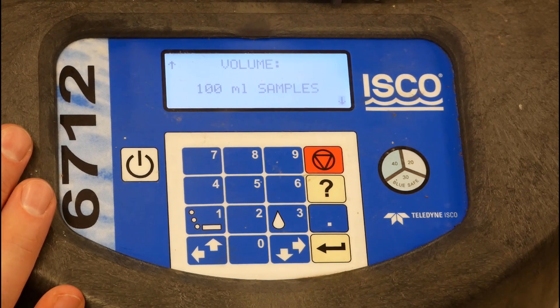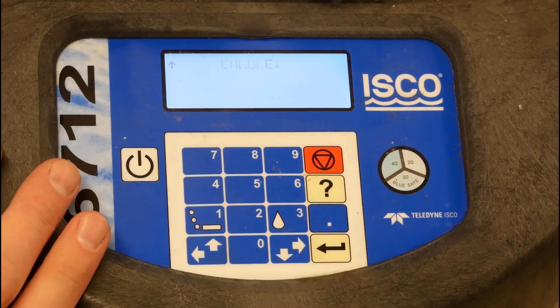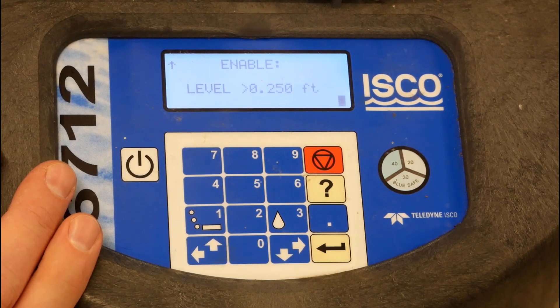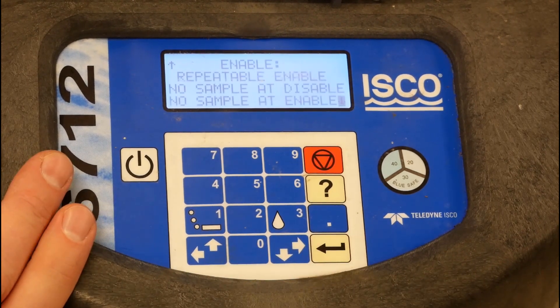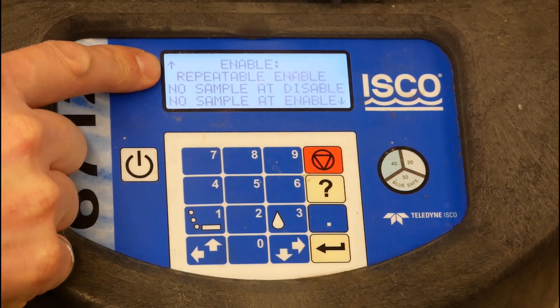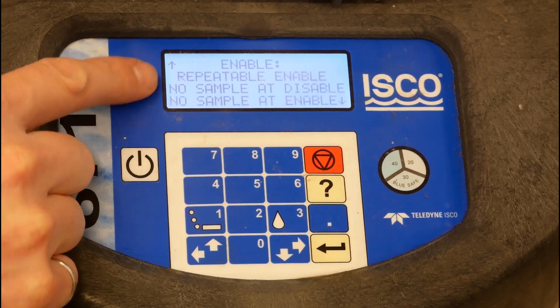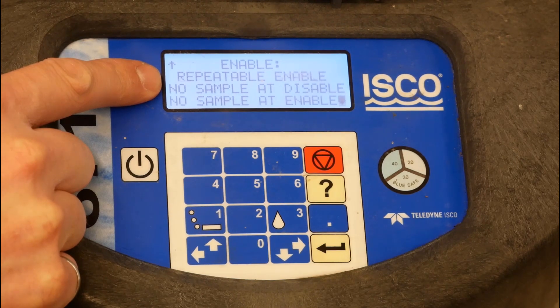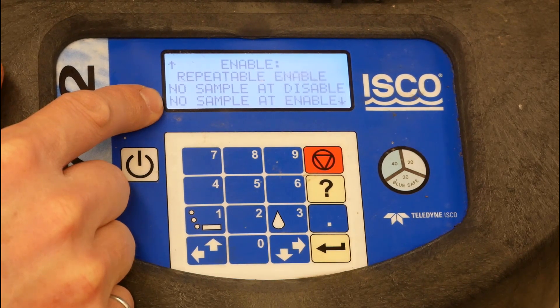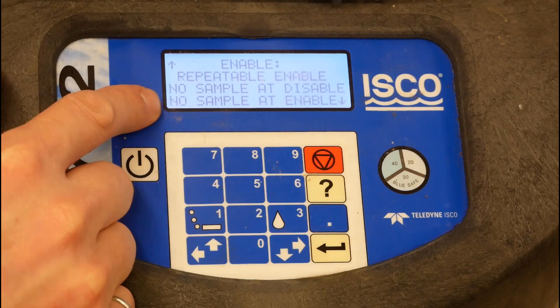Each time we sample, we're going to pull 100 milliliters. We're not going to enable the program until the water level is deep enough to pull a sample, which is 0.25 feet — that's the threshold to start sampling. We're looking at repeatable enable, meaning this program can get enabled if that condition is met multiple times. We're not going to sample when the water level drops below that threshold, and we're not going to sample immediately at enable — it's based on flow conditions rather than just an enable event.